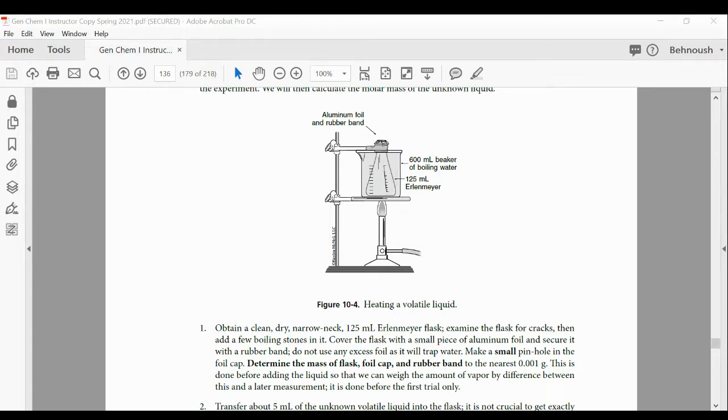Pressure at any time, or the instructor will provide the pressure. So if the instructor provides the pressure, that pressure measures the atmospheric pressure at any time, right? Atmospheric pressure. And so we are making another assumption. What is the assumption? The assumption is that the atmospheric pressure, so basically the pressure here, is equal to the pressure inside the flask.